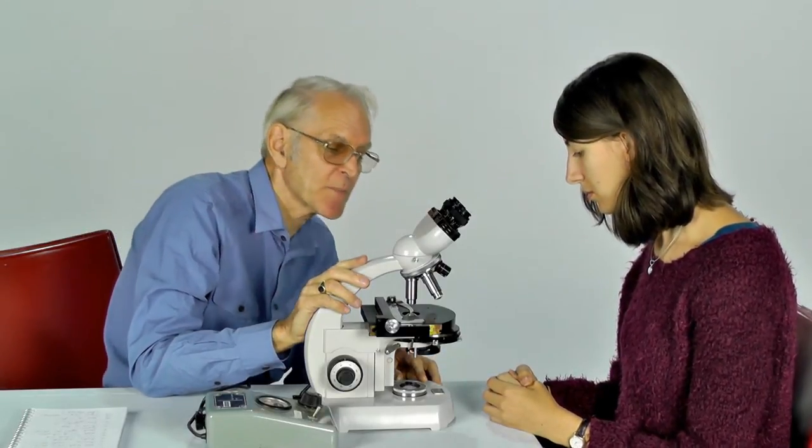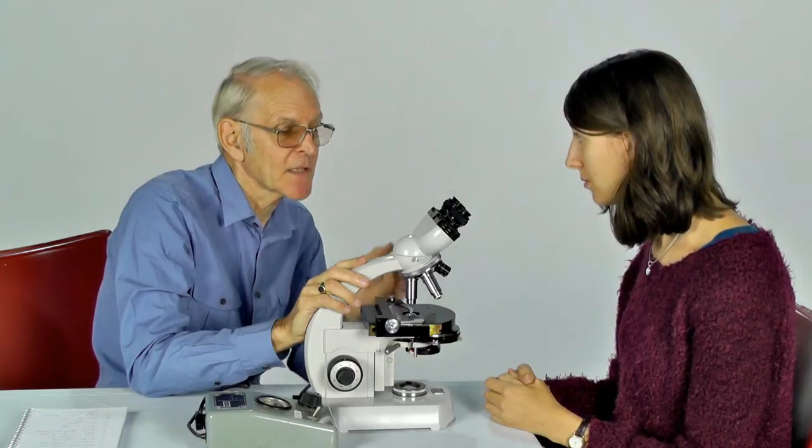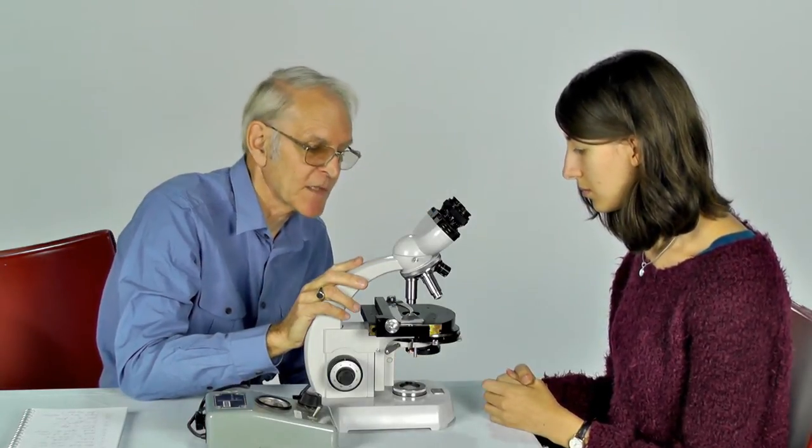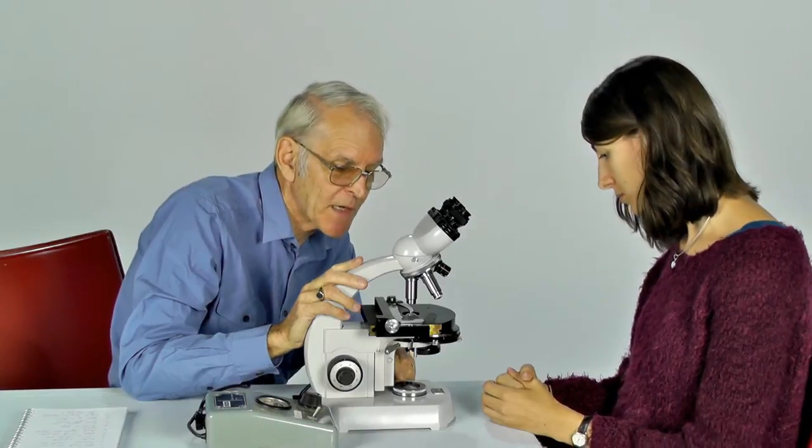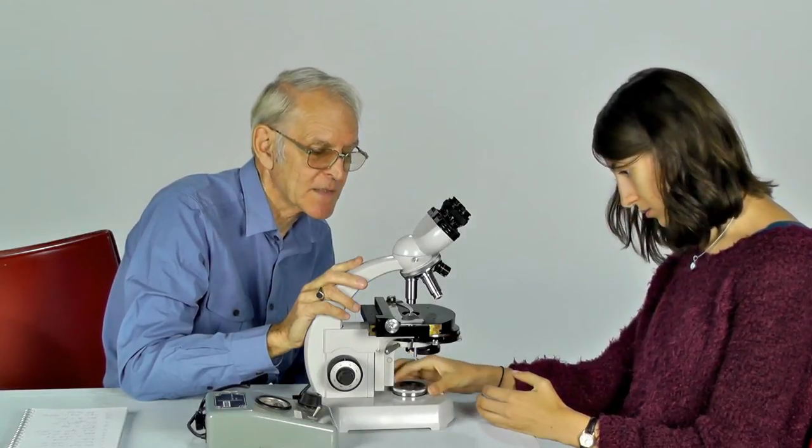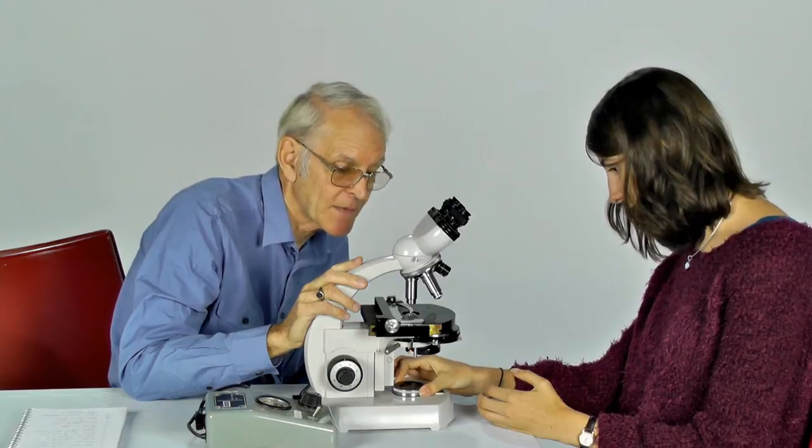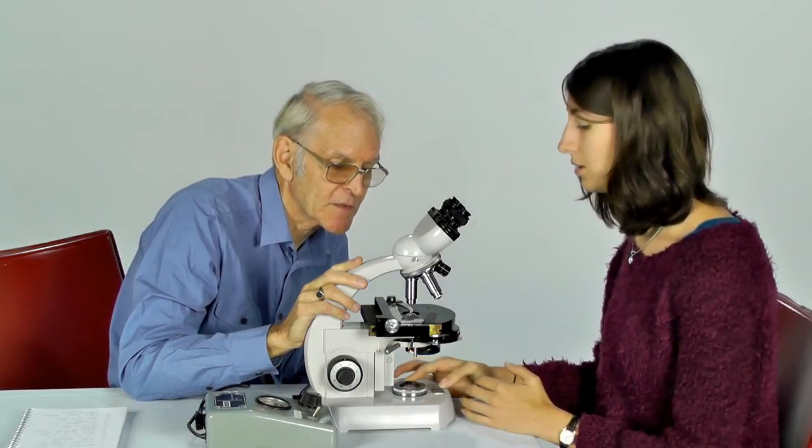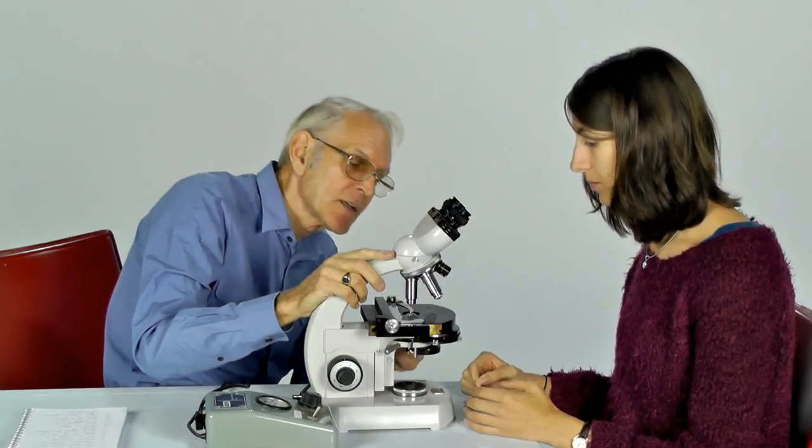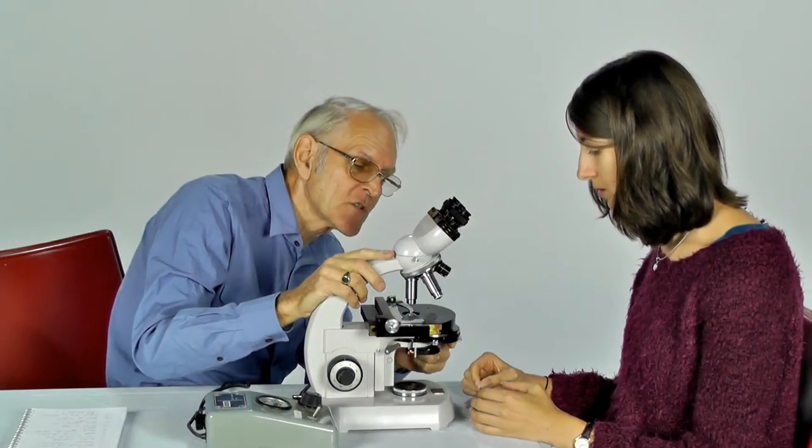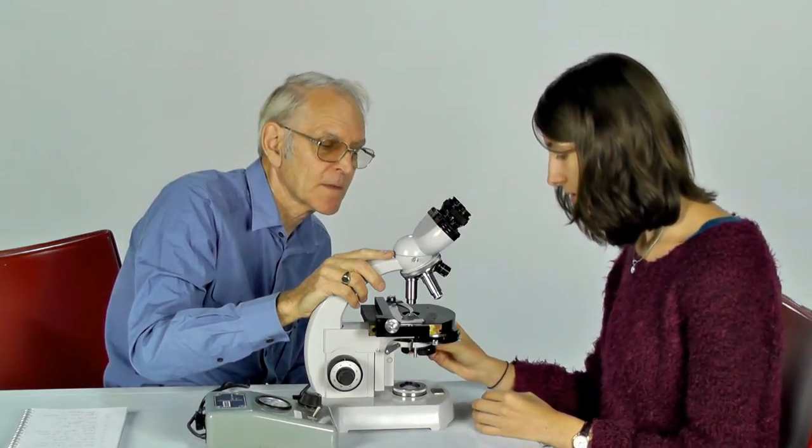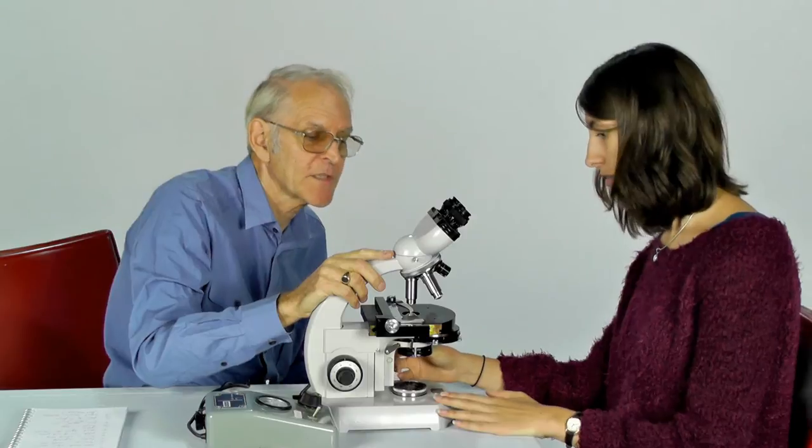Now the next step is to make sure that the light can travel unimpeded through the optical system of the microscope. So let's open up the diaphragm at the base, the field diaphragm, by turning that. That's opened. Good. Now we need to make sure that these filter trays are out of the way, clicked into position. Good.